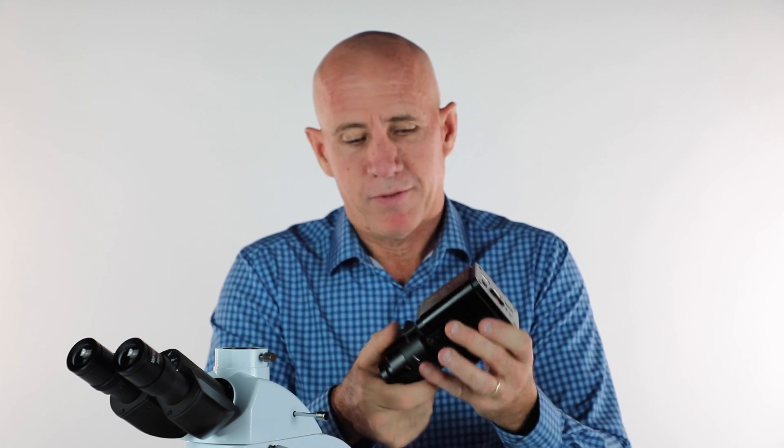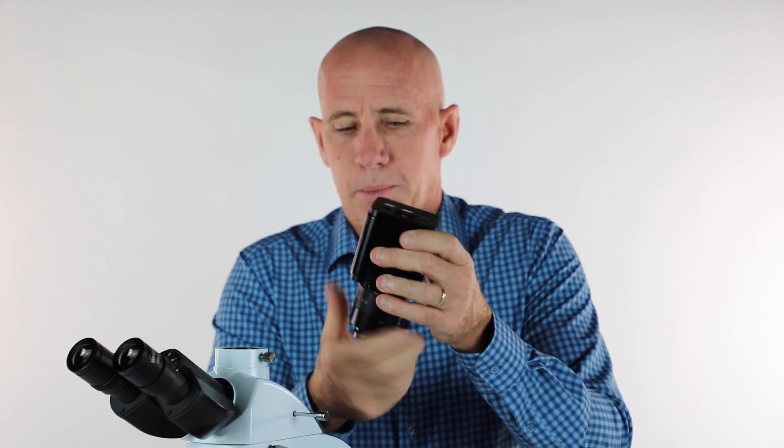Not all scopes have the 0.5 lens, but the i4 is set up nicely to match up for most all of our cameras. If you did have a one-inch sensor — a much bigger sensor in a camera — you would use a 1x pipe, and we have those. But right now we're matching up nicely with a 0.5x lens.